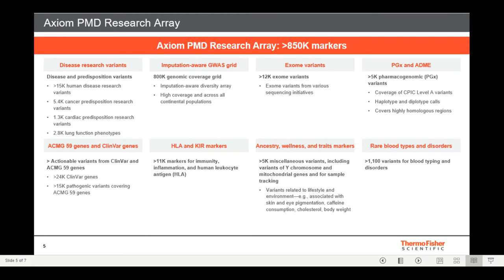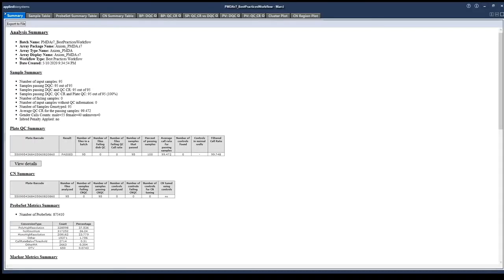Now let's take a look at the Axiom Analysis Suite software and begin to work with some of the copy number functionality using the PMD array as an example. If you have not used Axiom Analysis Suite before, I would recommend viewing our other webinar, Axiom Analysis Suite for Genotyping Analysis of Microarrays, to help gain familiarity with the basics of the software. First, let's look at an output of the best practices workflow for a set of PMD array data. For this array type, running the best practices workflow performs a sample QC, genome-wide genotyping, and a copy number analysis for some regions of pharmacogenetic interest. Let's focus on the sample QC aspect first.